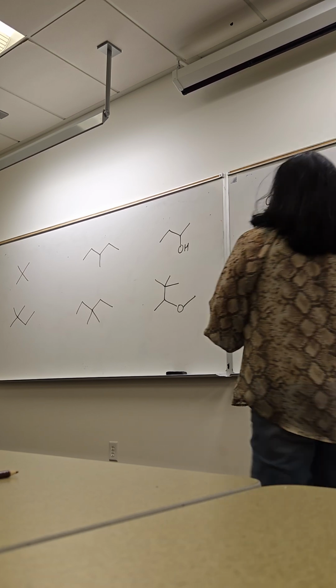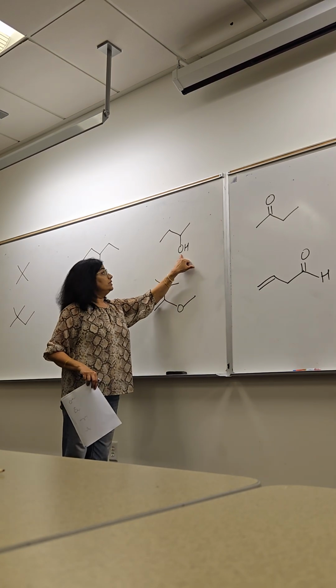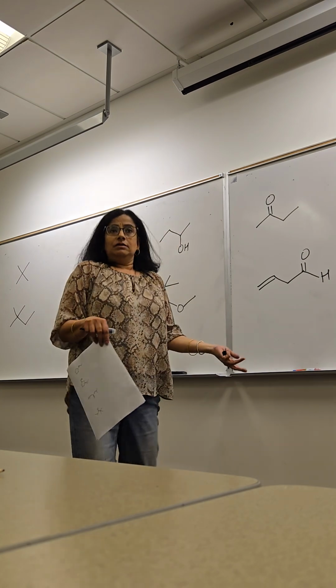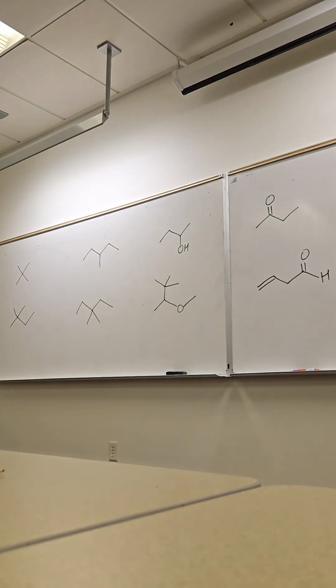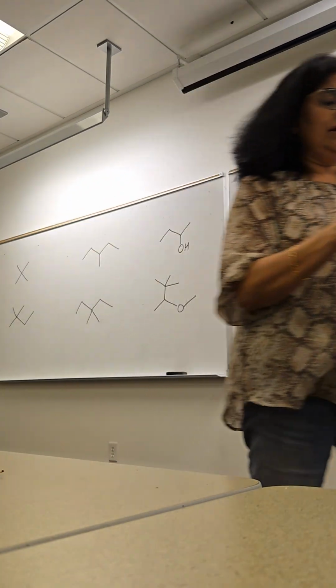I'm assuming you're talking about this, right? So this hydrogen which is on an oxygen, is it the same as this hydrogen that's on a carbon? No. So it'll have its own signal. But we look at all hydrogens. Absolutely. So do you treat oxygen like a carbon, but it just has its own signal? Yes, if that helps you better understand, then sure. You're looking at every hydrogen in the molecule. And there are many more.